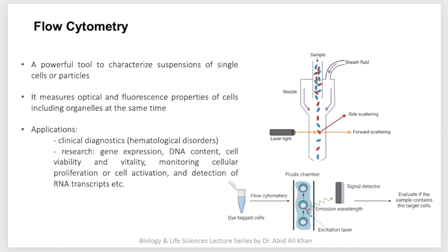It's an analytical technique which analyzes individual cells or particles. Initially, the technique was discovered and started with particles, but now a number of applications are performed with cells.